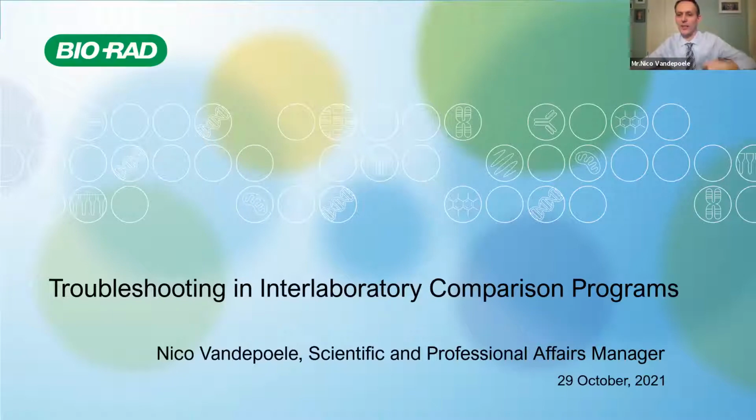Thank you again. I wanted to thank the organizing committee for giving me the time to talk to you today, and to say that I joined already for a bit of time, and I really liked the previous presentations. I also liked how they all tie together and talk about the quality of the tests. So for this last presentation, I wanted to talk to you a little bit about interlaboratory comparison programs and how we can use them to troubleshoot in the lab and what the differences are.